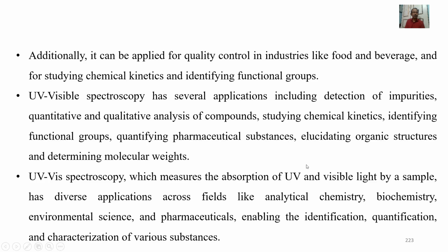UV spectroscopy, which measures the absorption of UV and visible light by a sample, has diverse applications across fields like analytical chemistry, biochemistry, environmental science, and pharmaceuticals, enabling the identification, quantification, and characterization of various substances.